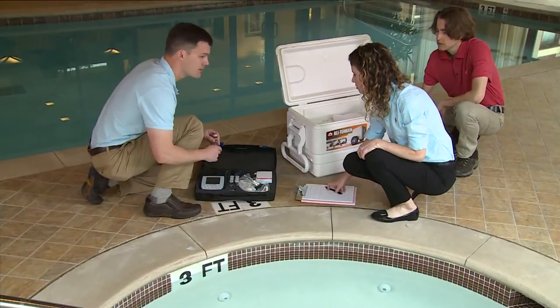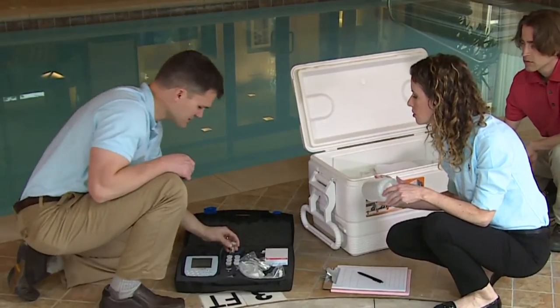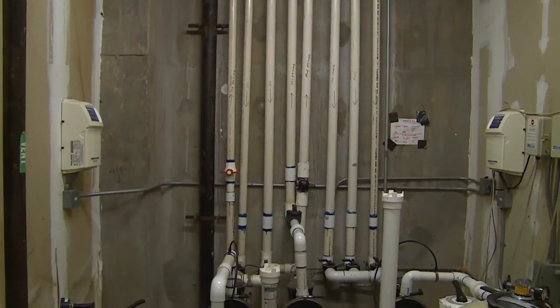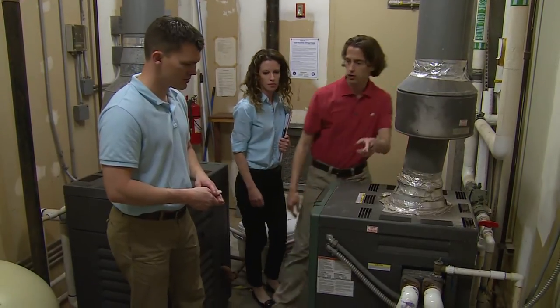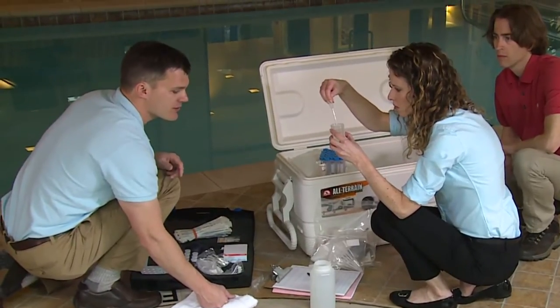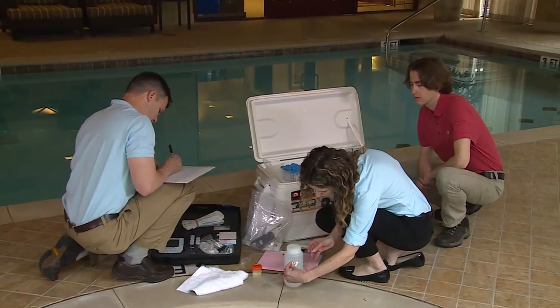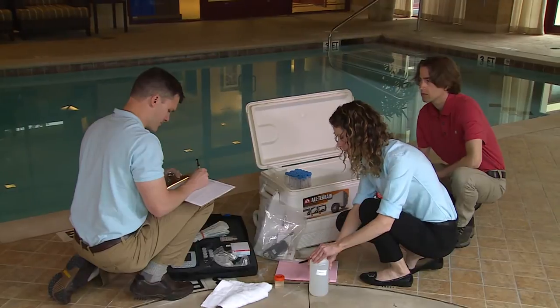If the spa is not drained, collect a 1-liter bulk water sample in a sterile 1-liter bottle. If the spa is partially drained, a swab tube may be used to collect the remaining water. If the spa has been completely drained, ask facility maintenance personnel for access to the compensation tank for collection of overflow water and take a bulk water sample from there. Add 0.5 milliliters of a 0.1 normal sodium thiosulfate solution to neutralize residual disinfectants. Tighten the top to prevent leakage. Label the bottle with a unique identifier, record the type and location of the sample on the sample data sheet, and place it into the cooler.